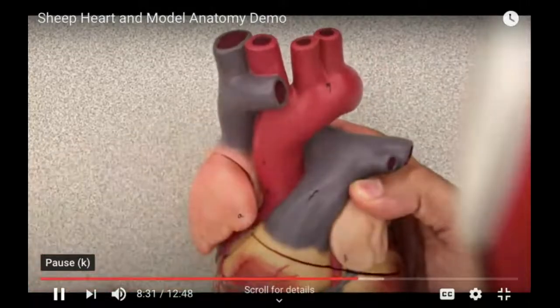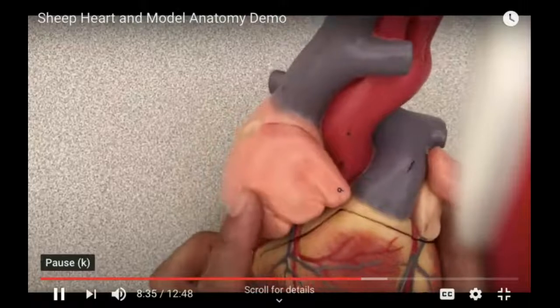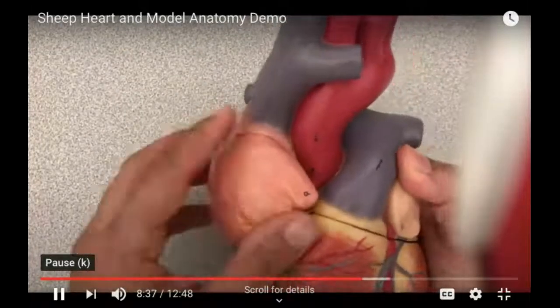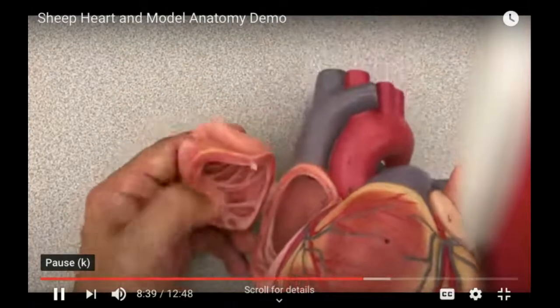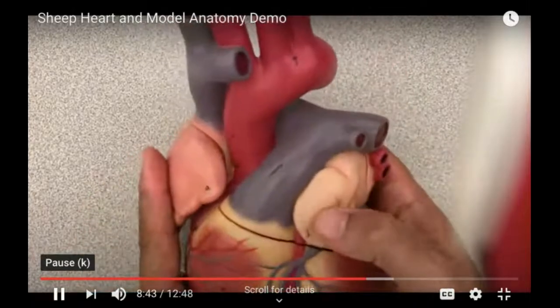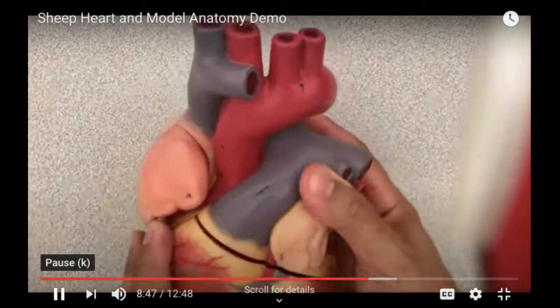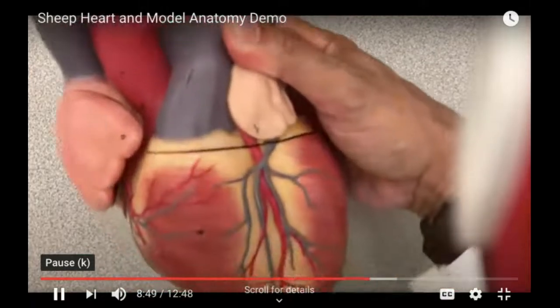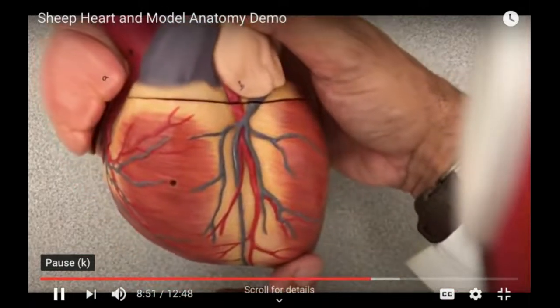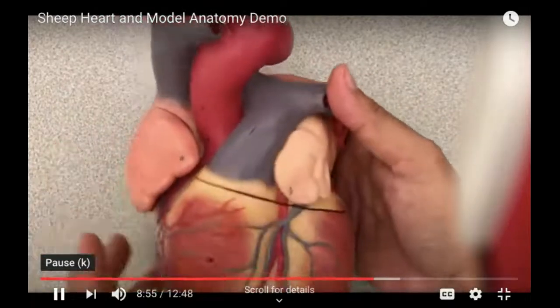Trunk just means short vessel. Here is the right auricle. Open it up. There's the pectinate muscle. And here is the left auricle. Open it up, and then the regions. This is the apex, and then across the top here, this is the base going around.